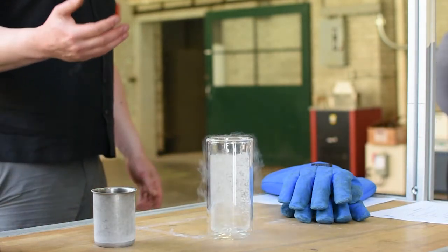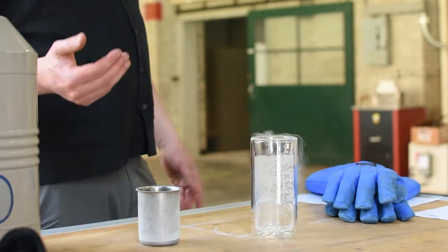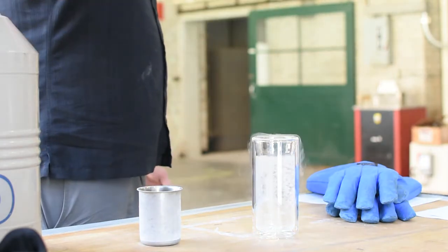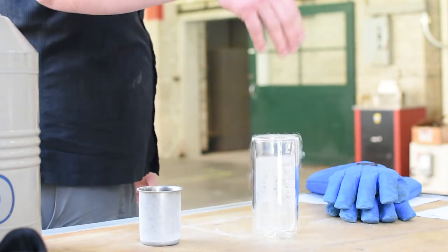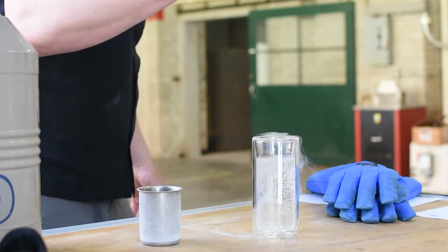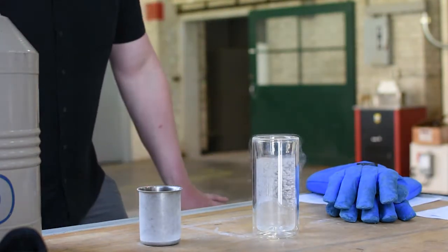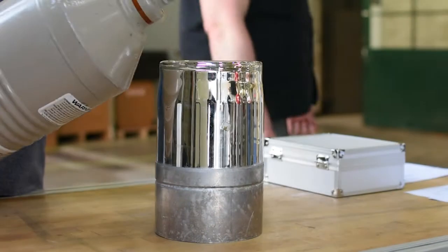Liquid nitrogen is so cold and everything around it is so hot that it forms a vapor layer whenever it's in contact with something very hot. What that vapor layer does is it insulates something and pushes the liquid away from it. So much so that I can take my bare fingers and just dip them in without getting burned. If we did that really close up with the video, you'd see that around my fingers a vapor bubble forms that insulates and protects it. Which means that as long as the liquid can just roll off and not get stuck or trapped, we're going to be safe that way.